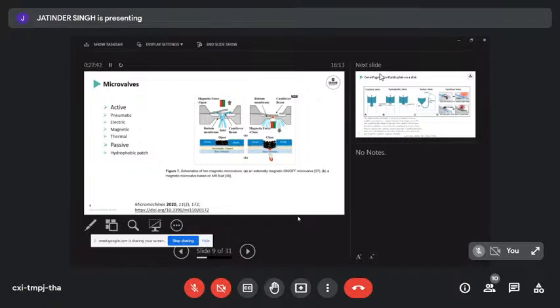So the hydrophobic valves are really popular to control the flow or time different events in single-use devices, because once they're primed, they're not useful anymore, but they're really great for using capillarity. If you want to have reagents sequentially being added, you can use a hydrophobic valve and hydrophobic patches to stop flows up to the point you want them to be reactivated again.